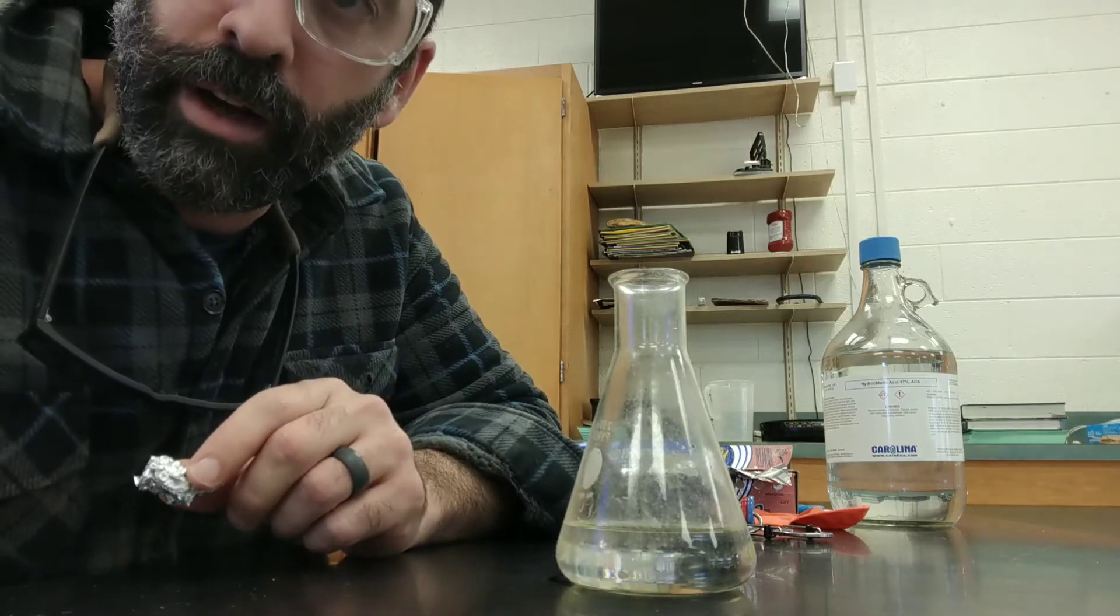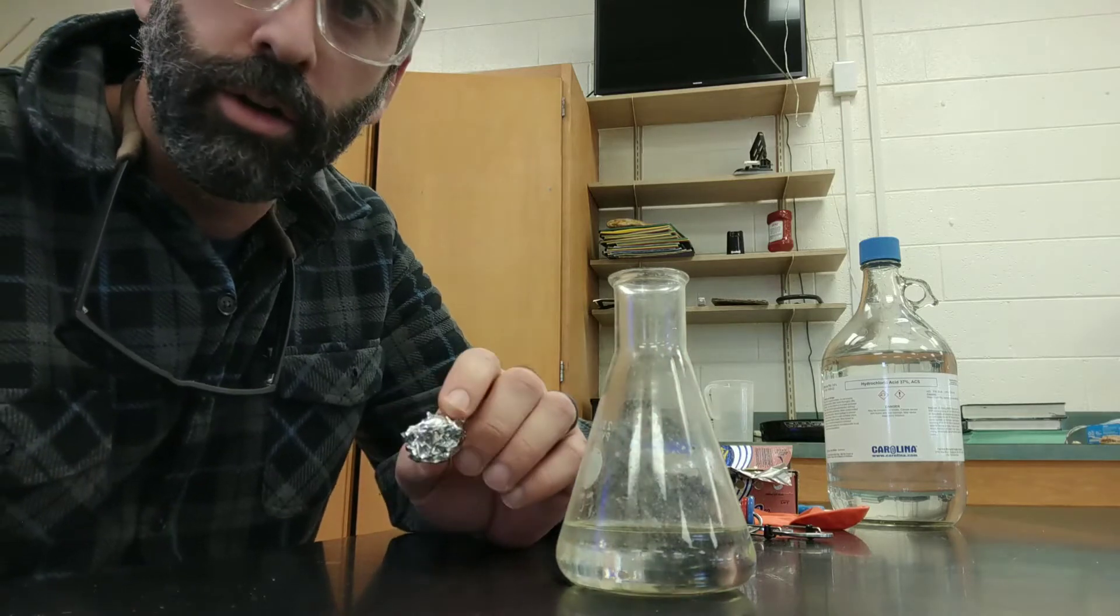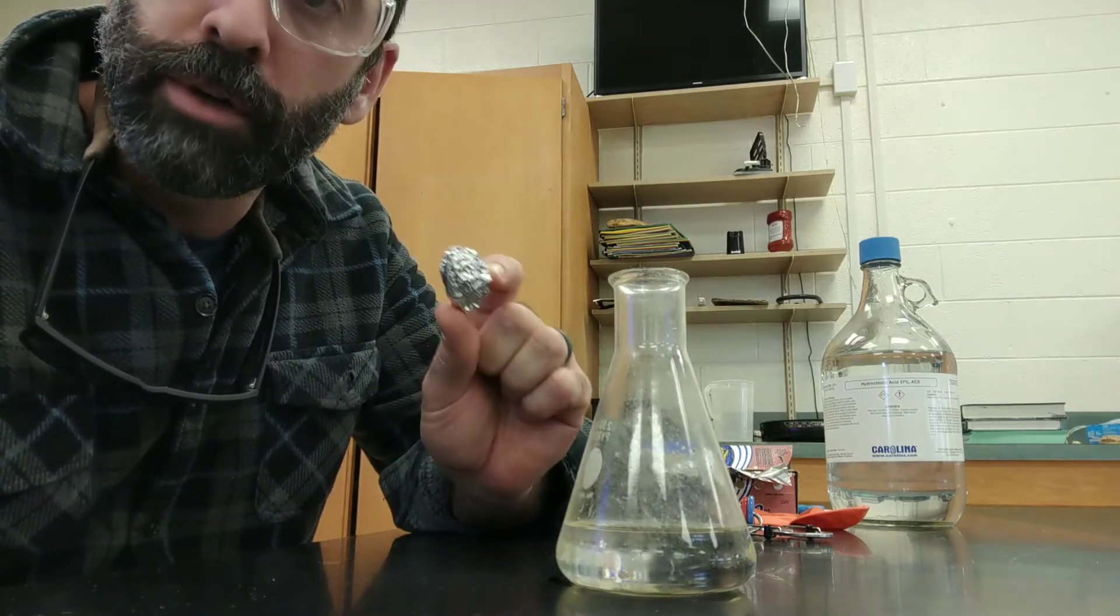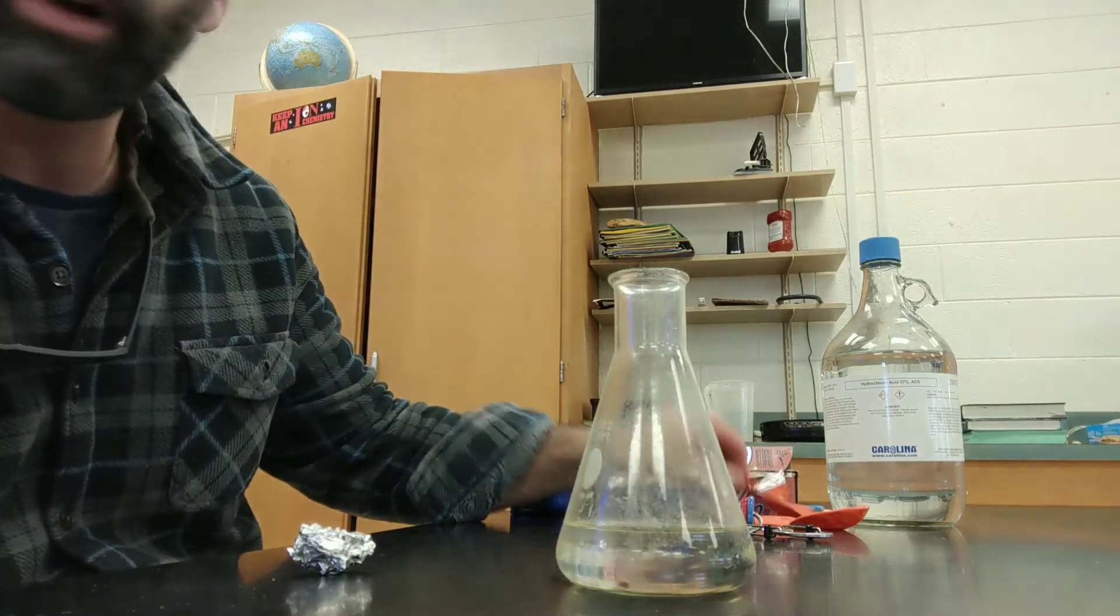I've got about 100 milliliters of hydrochloric acid in the Erlenmeyer flask. I've also got a ball of aluminum foil that's 10 centimeters by 10 centimeters, and I've got the balloon ready to go.